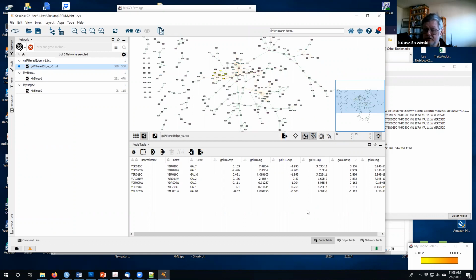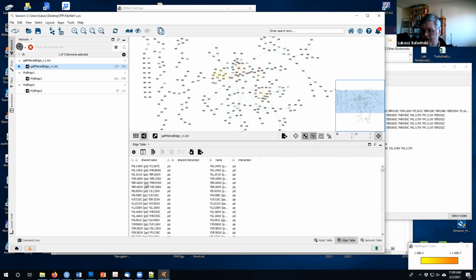This is something which is generated during your research. This is what's coming out of microarray data or mass spec data, or whatever experiment happened to be. And this is generally prepared in-house. The problem is with the file that generated the interactions.